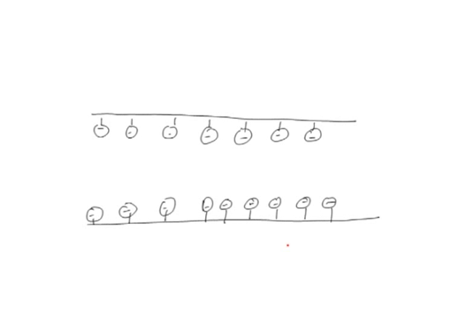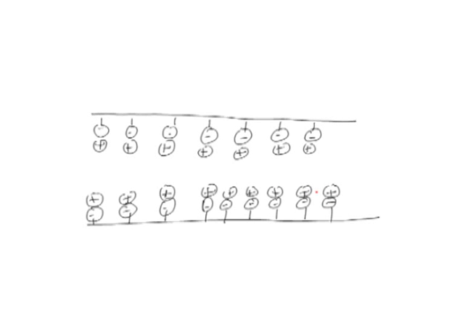Now, there is a particular electrolyte in the capillary, like if you say it is a free solution you are utilizing here, then that solution inside this capillary will carry both positive and negative charge. Now, what will happen? This positive charge will be attracted towards the negative charge here. So on the inner side of the wall, you have a layer being created, which we call a double layer of negative and positive charge.